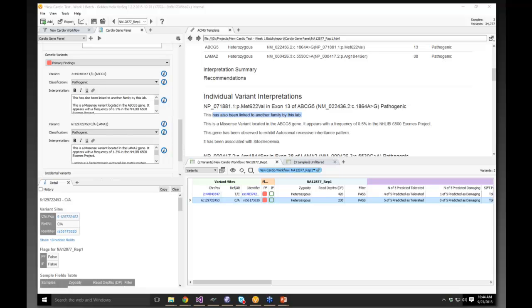Are there any plans to add a CADD score annotation database to VarSeq? So we're looking into that, and it's basically going to be driven by user demand. There has been a number of functional kind of ranking scores, like these all-encompassing bioinformatics scores out there, and I'm not quite sure if one has a discrete advantage over the other, but feel free to contact us if you're interested in that, or if you have your own license, etc.